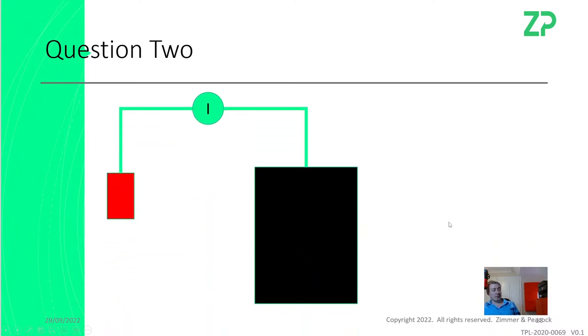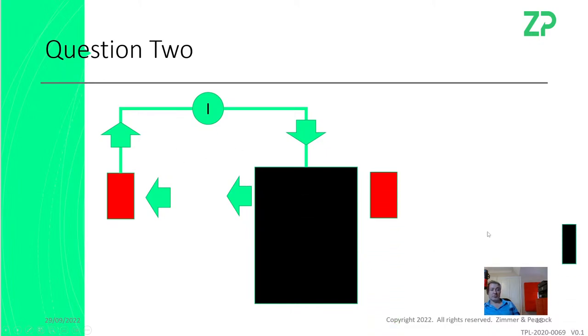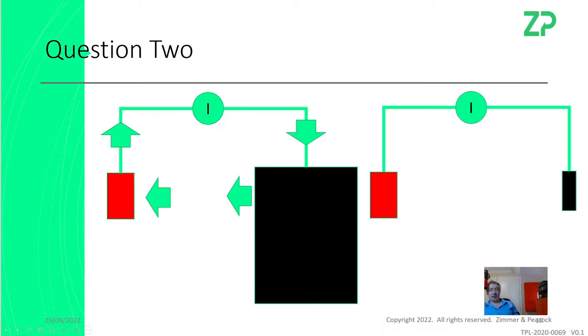Well, I explained it earlier on, but the reason people tell you it has to be bigger is because, let's say you're doing voltammetry or amperometry, you've got current flowing through the circuit and ions flowing through the solution. And you want that counter electrode to in no way be the rate limiting step in this entire circuit. So you can make it rather large and therefore it's not the rate limiting step. But as already discussed, ours can sometimes be smaller, and yet our sensors work perfectly fine.